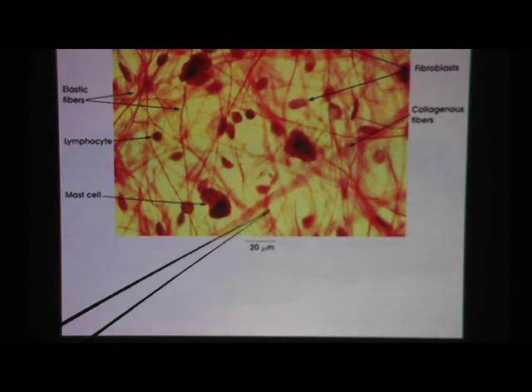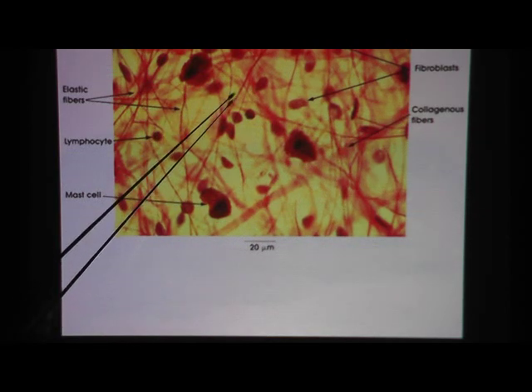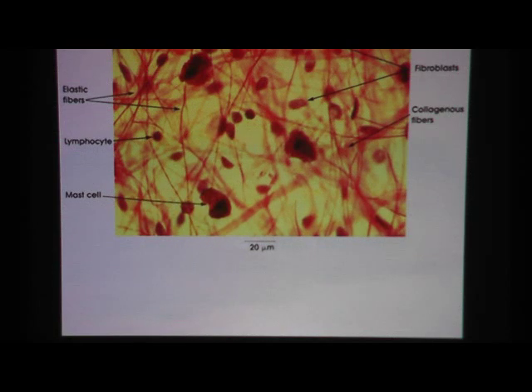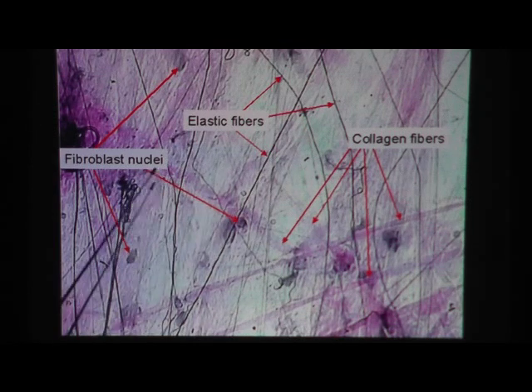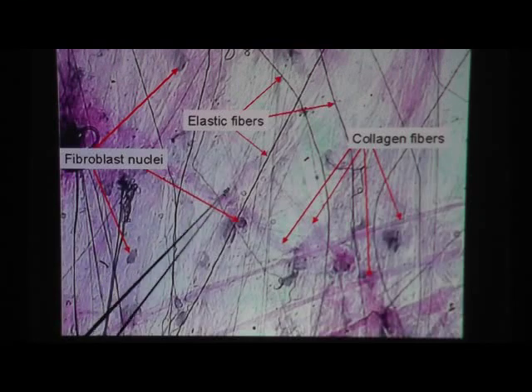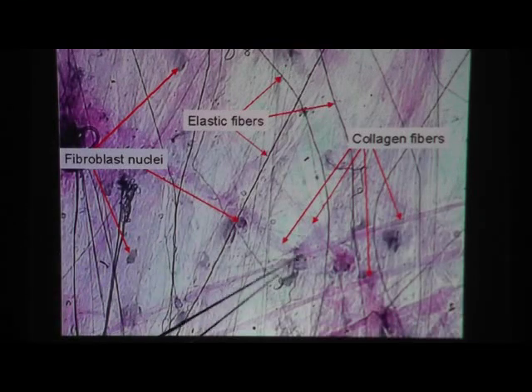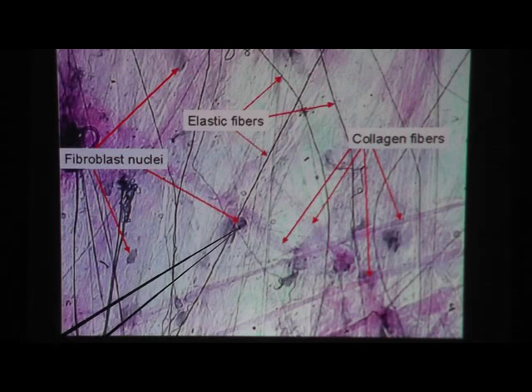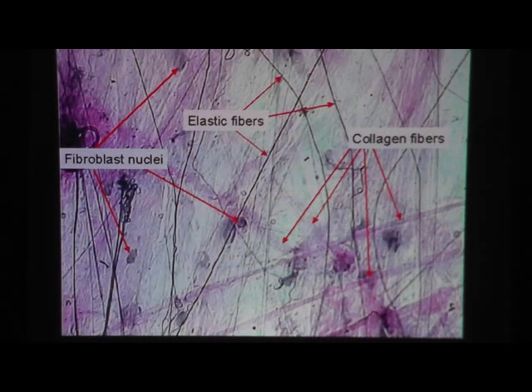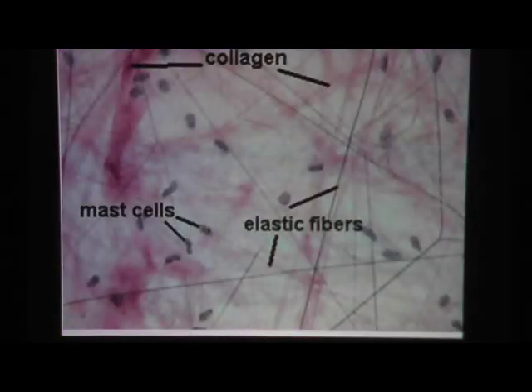Here you can clearly see the collagen fiber — the thick one. The skinny one is the elastic fiber, and this whole tissue is areolar connective tissue. Here's another look with a different dye, more bluish in color, but you can faintly see the collagen fibers. The dark ones are elastic fibers, labeled E to C. And the nuclei visible here belong to fibroblasts.